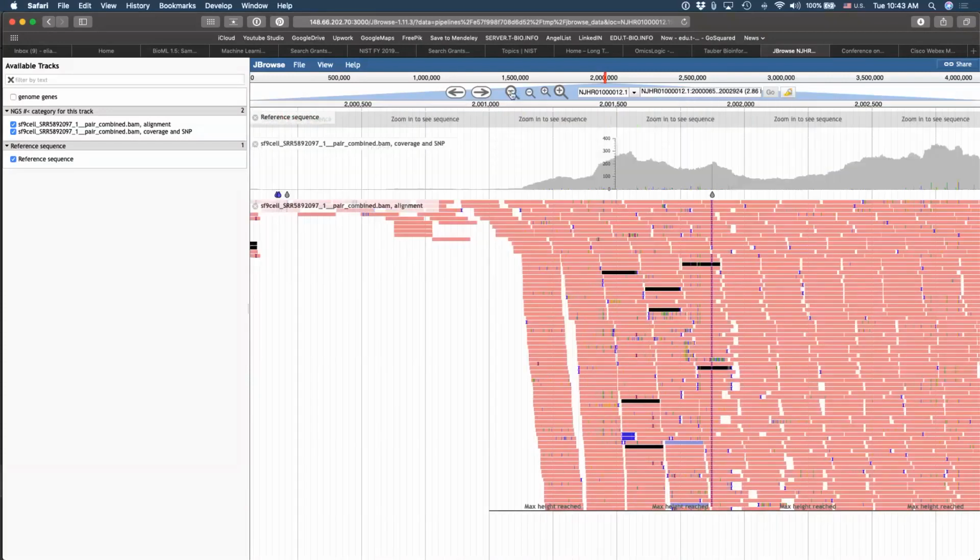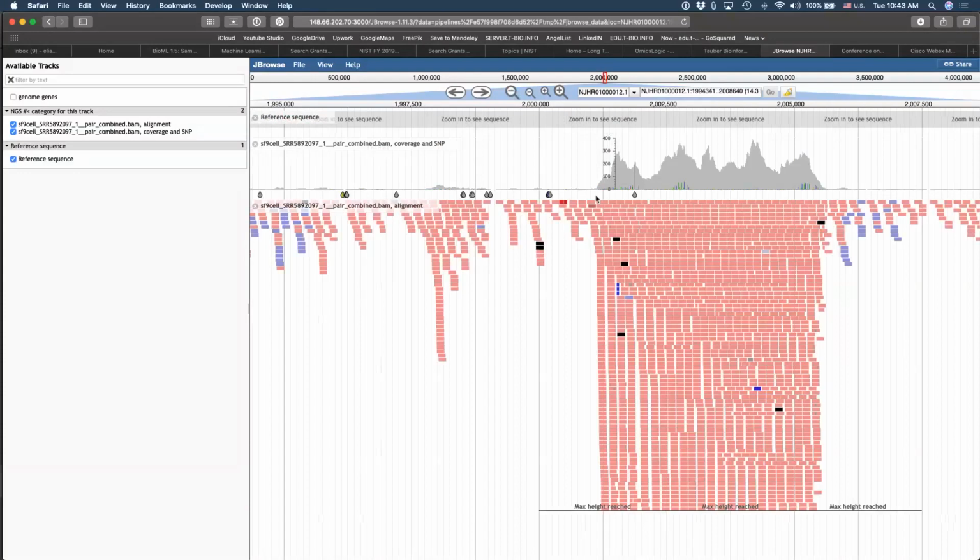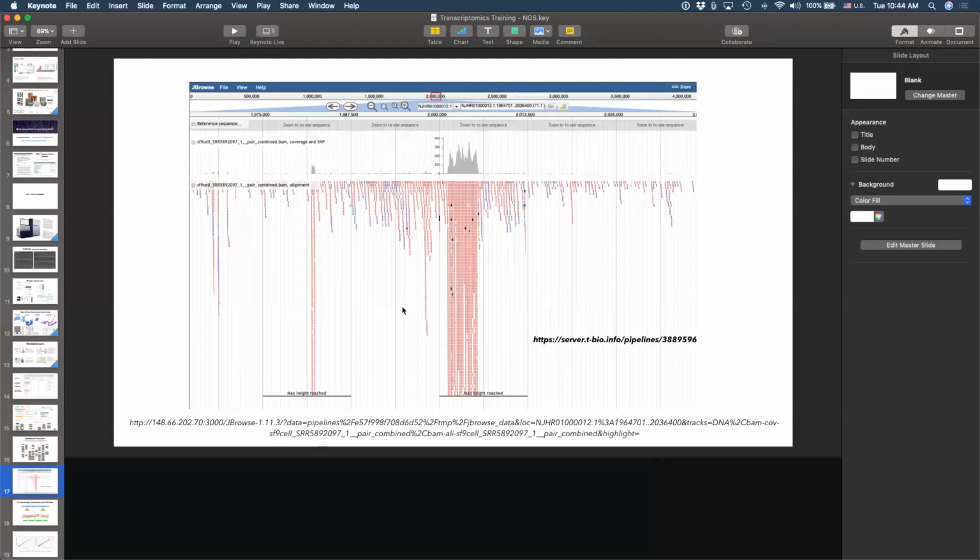So if we zoom out, now we can see that over here is a portion that is expressed. So this is more expression than, for example, right here. And some regions will have nothing. But of course, this is mapping onto the full genome, so we're including here both the exons and the introns. And so we are just visualizing right now what it means that we align the reads to the reference genome. Okay. So now if we continue, let's understand how we can use this information and what other steps are necessary to be considered when we talk about RNA-seq.